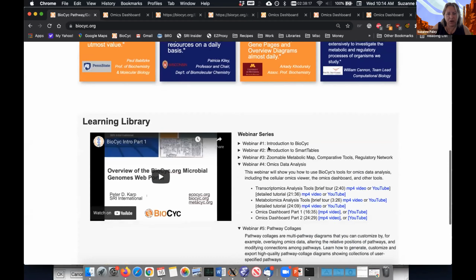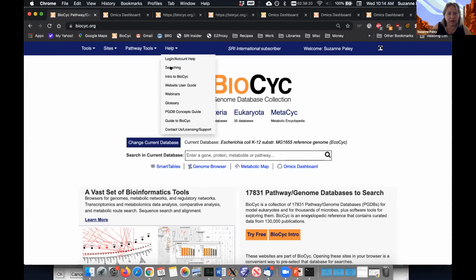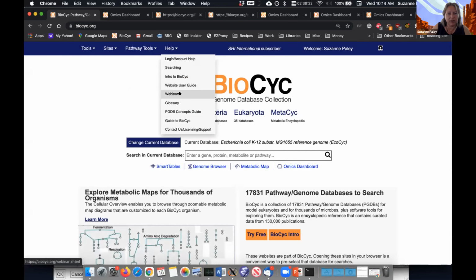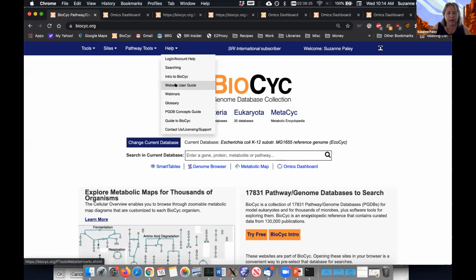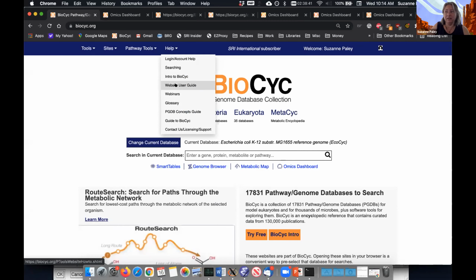This is from the homepage, but it's also under the help menu from any page. Get to the webinars link. And there's a website user guide, if you don't want to watch videos and you want to read about it. This gives more information about, for example, the omics data file format, if you don't remember everything that I've said here.